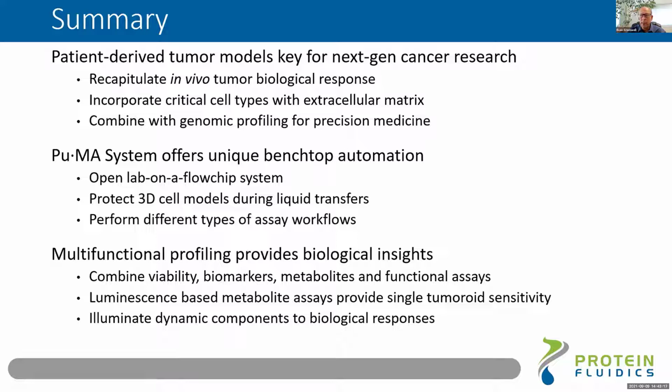I didn't emphasize it, but by dynamics, we are collecting the data in 2 to 3 hour time slices. Again, if you let the tumoroids secrete overnight, you're going to get a lot more material. But with the sensitivity of these luminescence assays, you can really think about doing 30-minute, 60-minute time points, and you collect enough secretion from those in discrete sampling that you can really map out the dynamics of metabolism and response of cancer models to treatment.